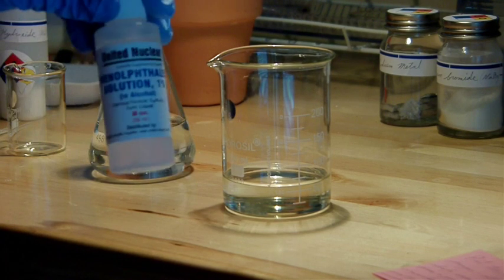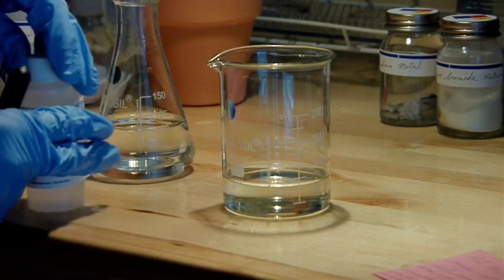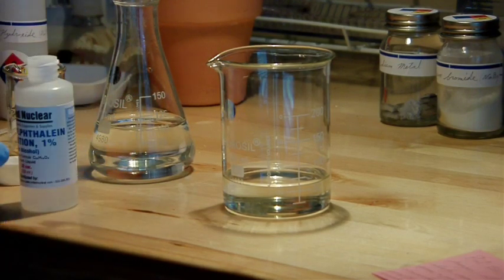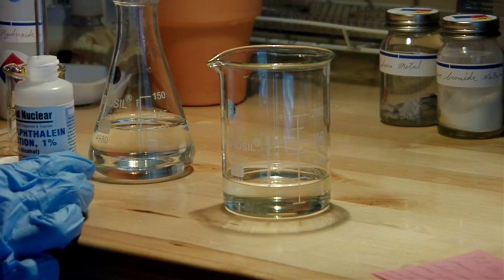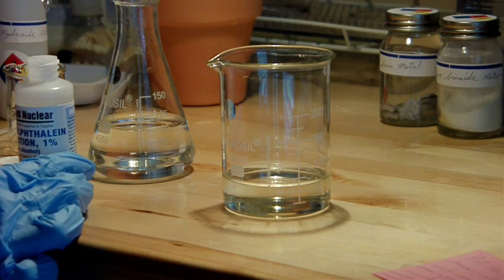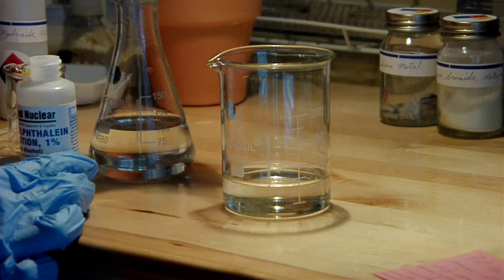So the first thing to do is to add a couple of drops of phenolphthalein indicator solution to the acid. And this is a very powerful indicator, so you really only need a couple of drops of it.